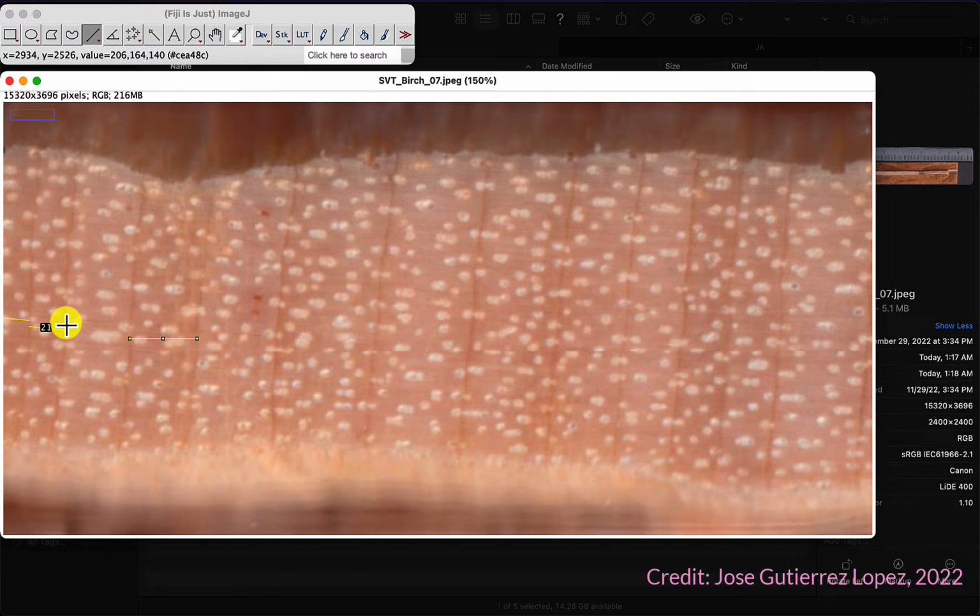Oops, I missed pressing the T on that one. There.